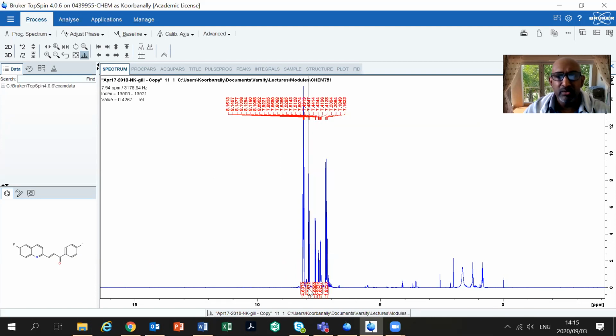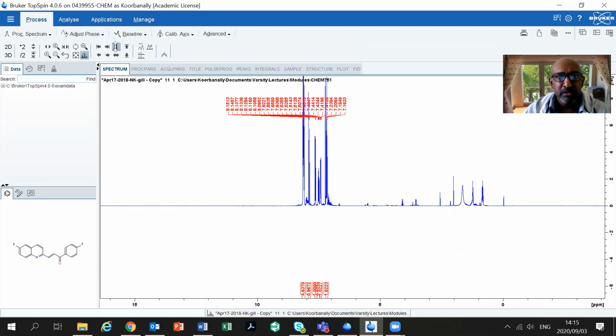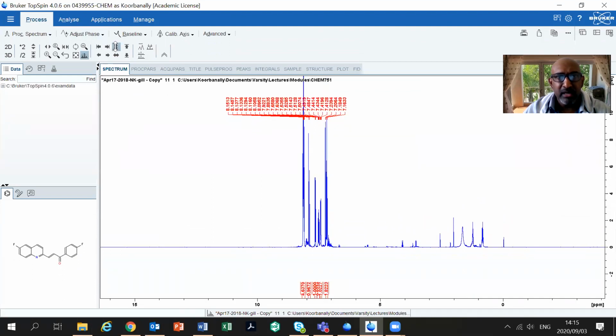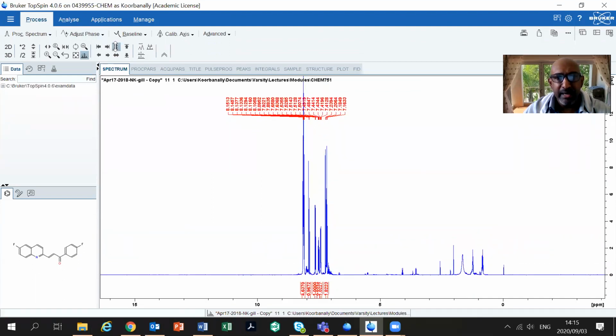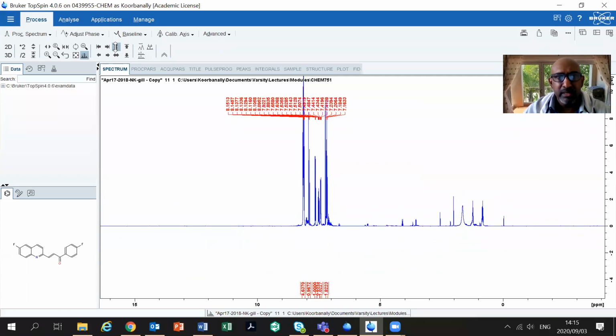So I was playing around with this as well. All right. Now I want to introduce you to these buttons here. These buttons allow you to move, and I'm using this particular arrow that you can see here. You can see I can take it to the bottom, take it to the top, just by holding down my left button on my mouse. I'm staying on that particular grid, and I'm just going up and down by just using my mouse, right?